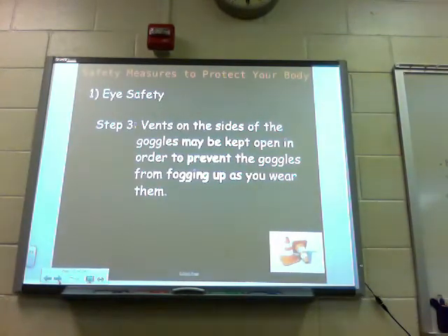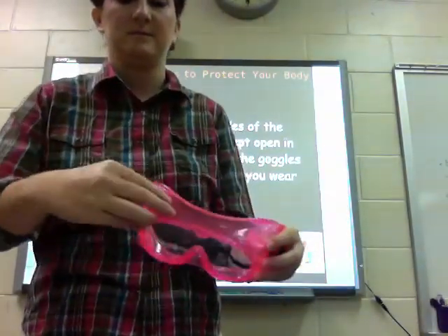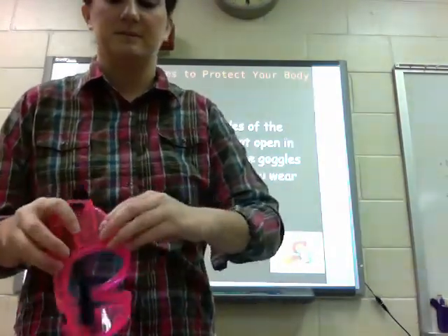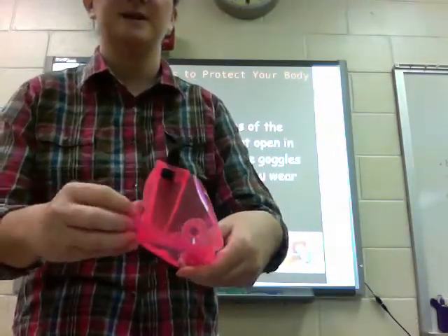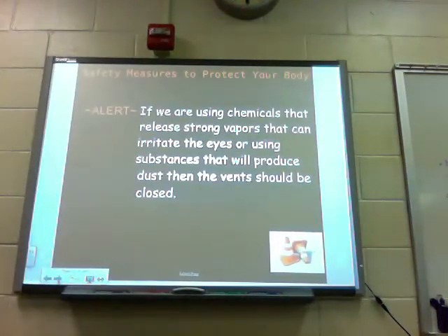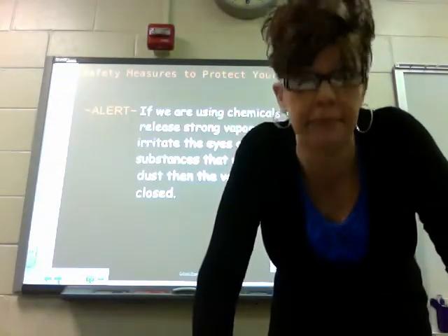Step number three: vents on the sides of the goggles can be kept open in order to prevent the goggles from fogging up as you wear them. You can keep the vents open during the lab to help with that — Ms. Culp is opening the vents, you simply pull them up. If we are using chemicals that release strong vapors that can irritate the eyes, or using substances that will produce dust, then the vents should be closed.